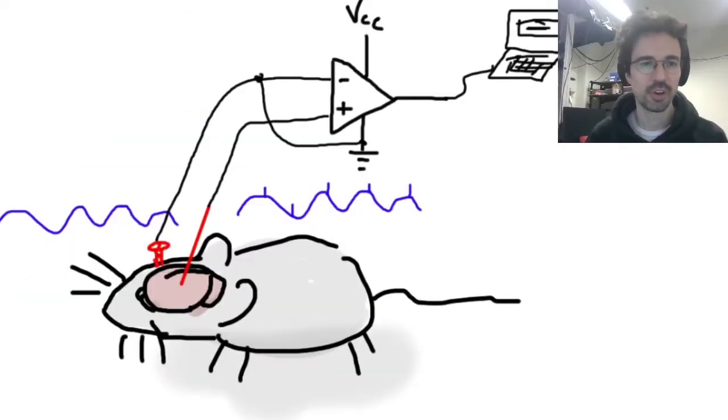So there's one more interesting and practically important thing when it comes to grounding animals or ourselves in the case of EMG, EEG, what have you. And that is we typically also put ourselves or animals in Faraday cages. And as we talked about, the input impedance of the inverting input of our amplifier doesn't matter much because it's basically being fed by the infinitely low output impedance that is ground, right? Ground can source or sink as much current as is needed.